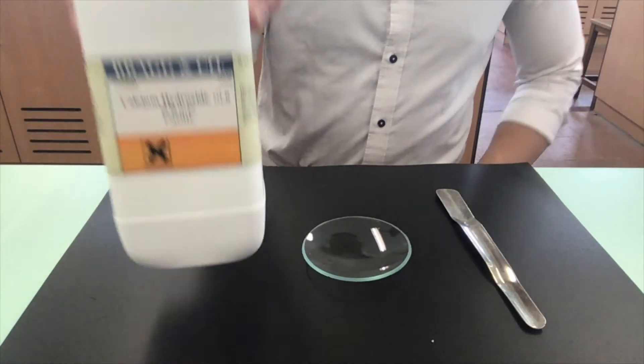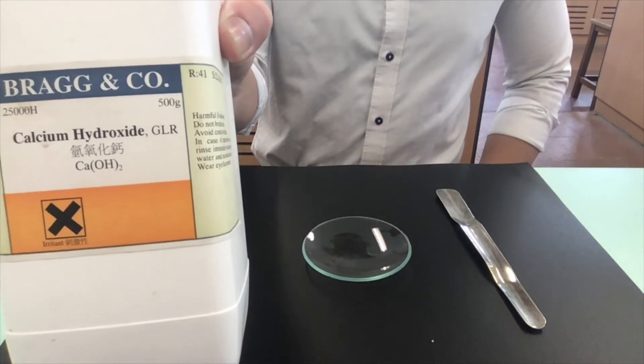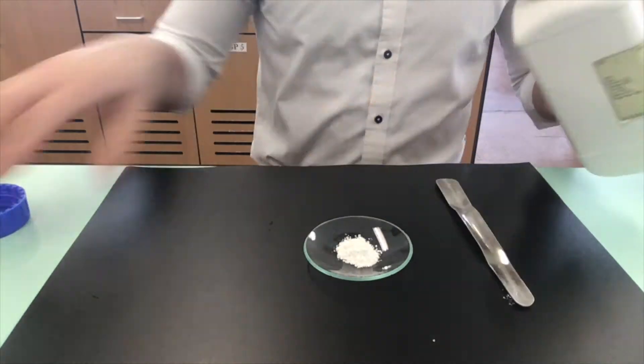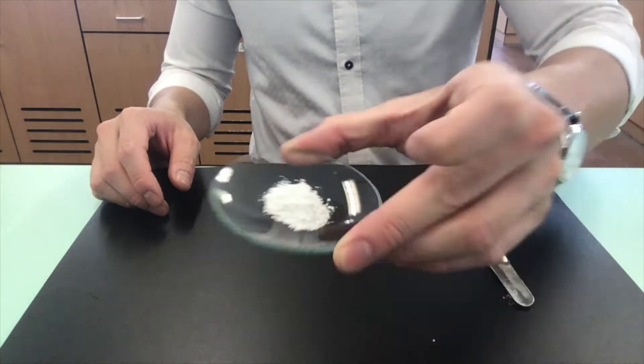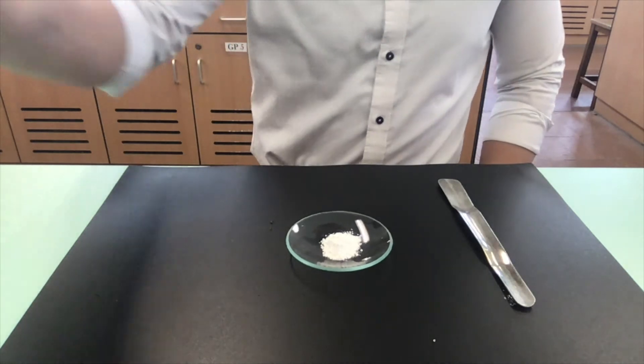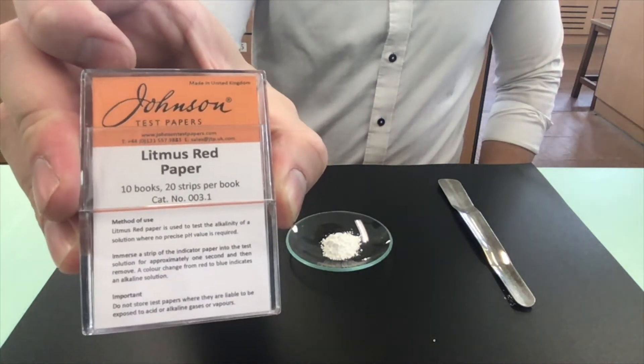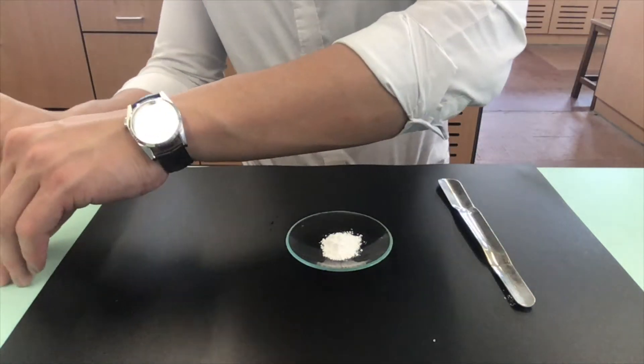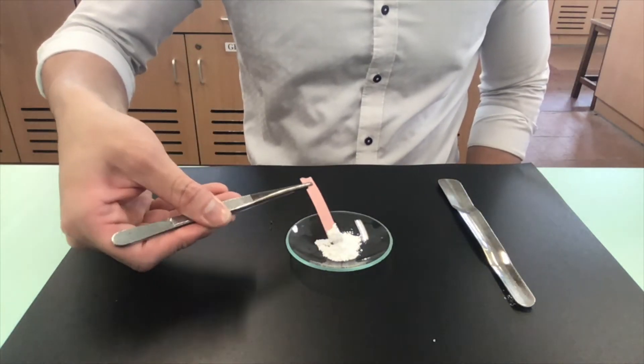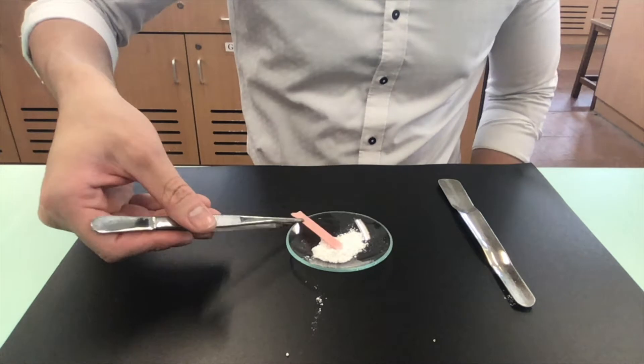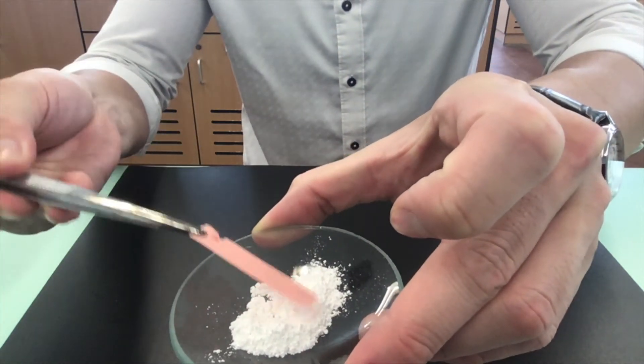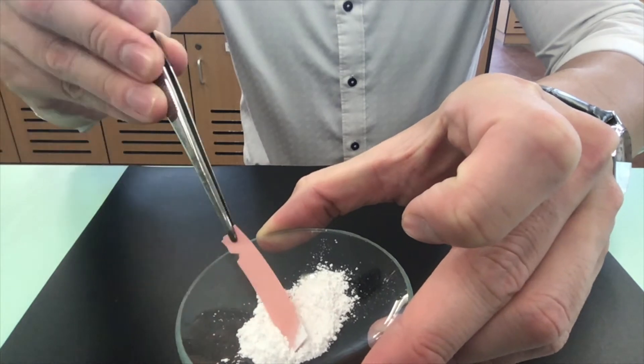This is a sample of calcium hydroxide solid. Solid calcium hydroxide is a white powder. We will test the solid using red litmus paper. There was no color change on the red litmus paper, meaning that the alkali didn't show its alkaline property.